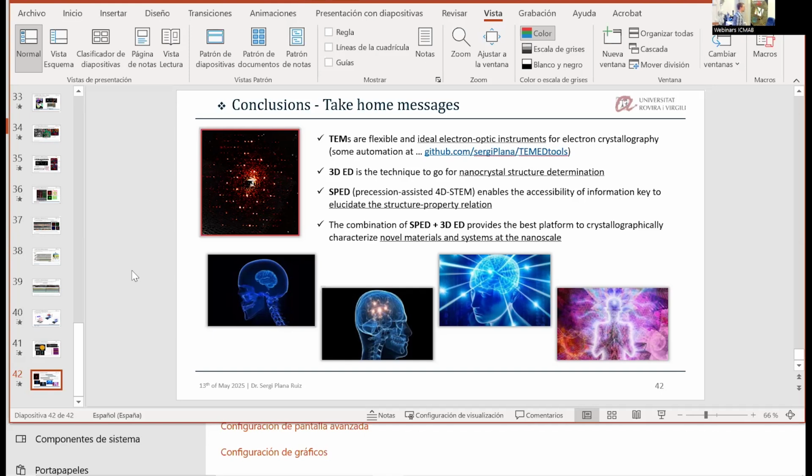So usually what I tend to do is to acquire the most data possible in everything that we measure, so that we are not constrained by that fact. And even if, for example, it's a monoclinic or triclinic structure, which requires a lot of volume in the diffraction space to be sampled, then you can merge the data from different crystals, and this allows you to increase the completeness, and you may have more chance to solve the structure.